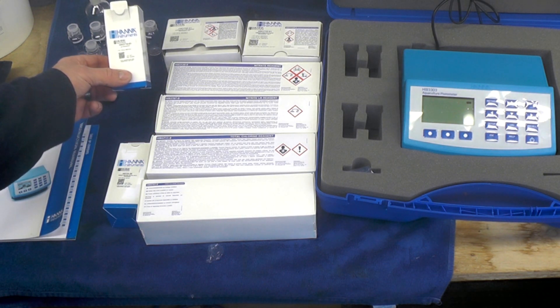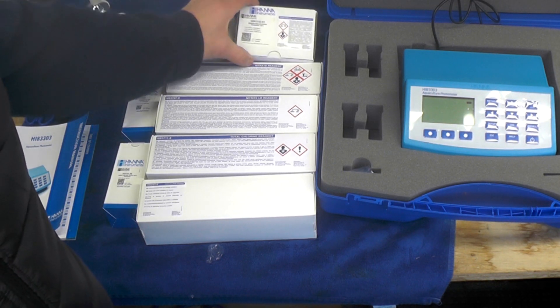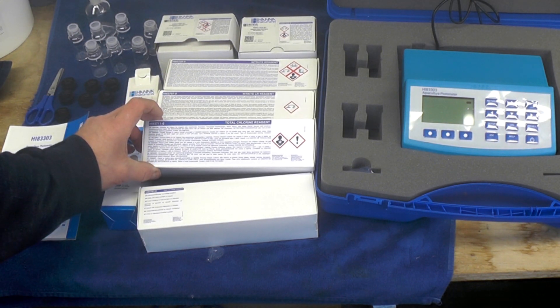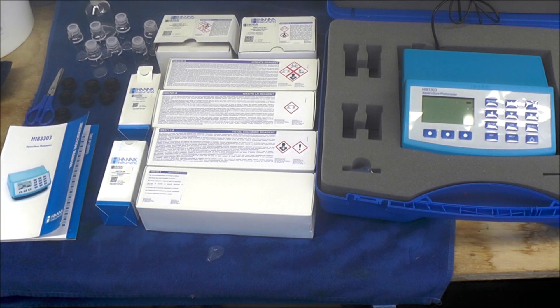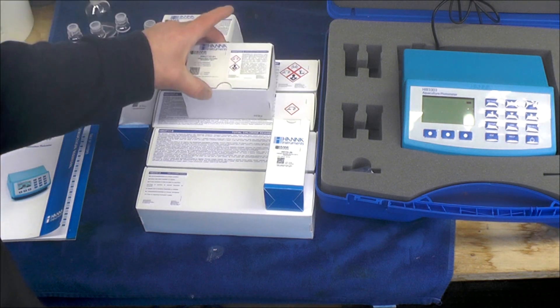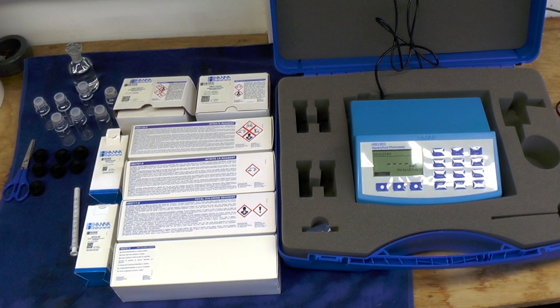You can see there are eight tests that we're going to do. We've got the pH reagent, ammonia low range, dissolved oxygen, nitrate, nitrite low reading reagent, total chlorine reagent, and free chlorine reagent. We're going to do readings for all three ponds, but on this video I'm only going to show the ones I didn't do last time: the free chlorine, total chlorine, alkalinity, and dissolved oxygen.